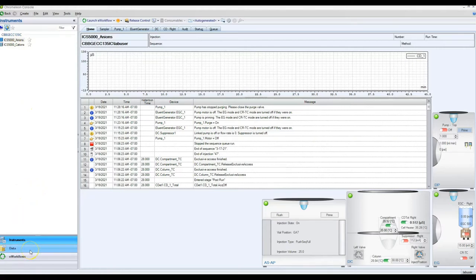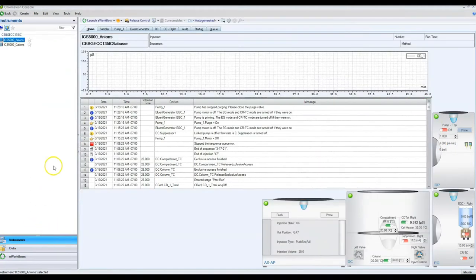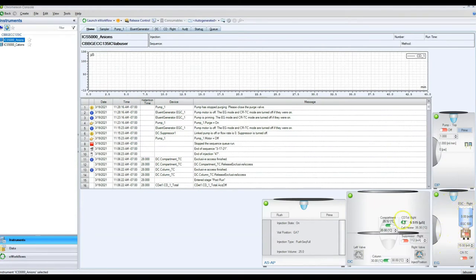The Data tab is where we set up our sample runs — where we tell the instrument where all our samples are and what type of analysis we want done. In the bottom right of this tab there's a diagram that mimics the instrument, oriented the same way the instrument is set up in real life. The pumps are on top, the eluent generator cartridges sit below, and the columns are here in the TC compartment — TC because it is temperature controlled.